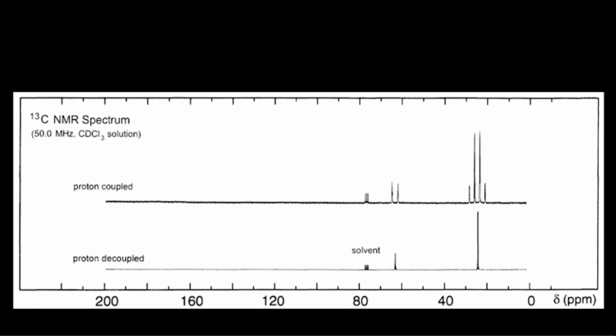Okay, from the C13 NMR spectrum, how will we conclude that an OH group is present? Can we get the evidence from the C13 NMR spectrum or not? Actually, the O group is attached to carbon, right? It is always attached to carbon. So from the chemical shift value, the carbon gives a higher chemical shift where it is directly attached to oxygen, as compared to carbons that are only attached to carbons or hydrogens. So that's how it helps us. The C13 NMR spectrum can tell us that the carbon is attached to some type of electron-withdrawing group.